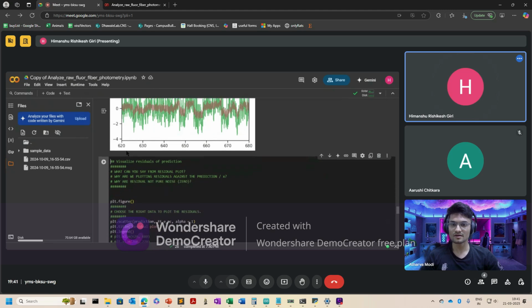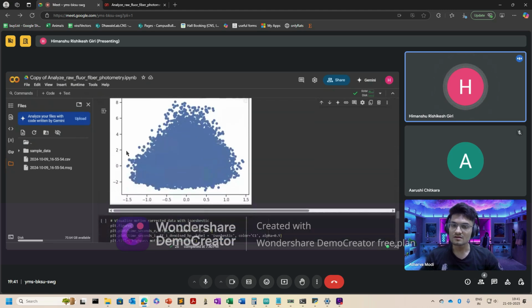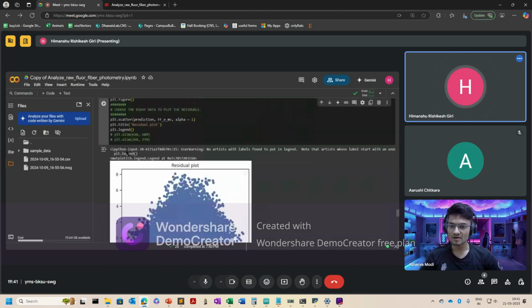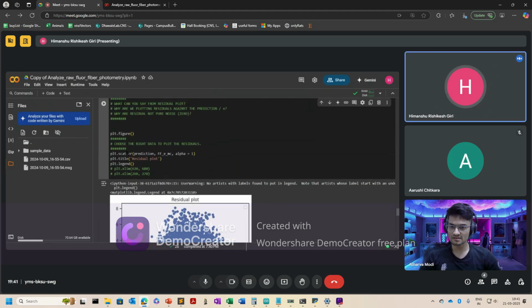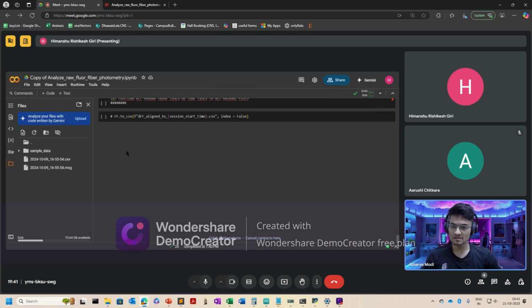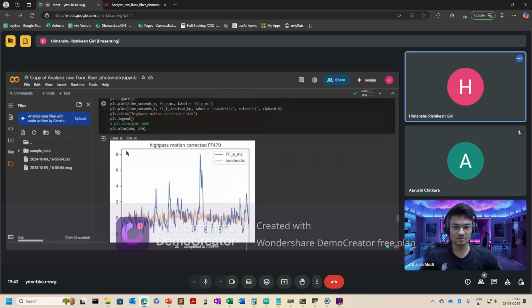Okay. Now not many cells are left. So you can just run as much as I have done. Arushi, do you have loaded data you want to run? No? Oh, she is listening.